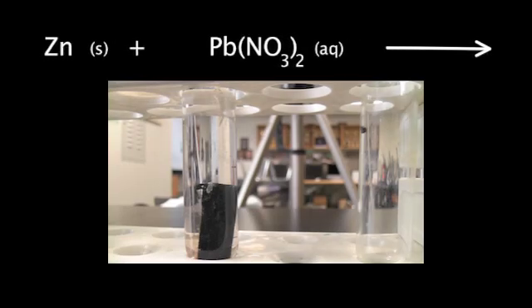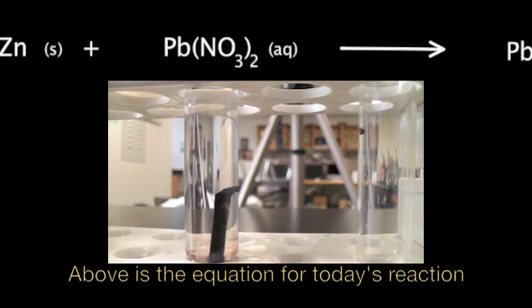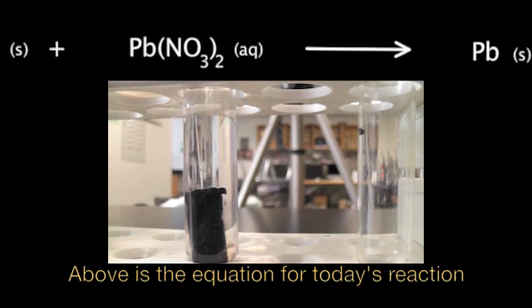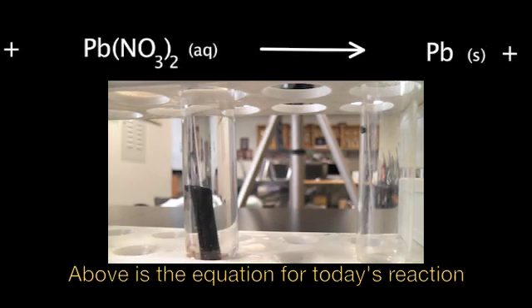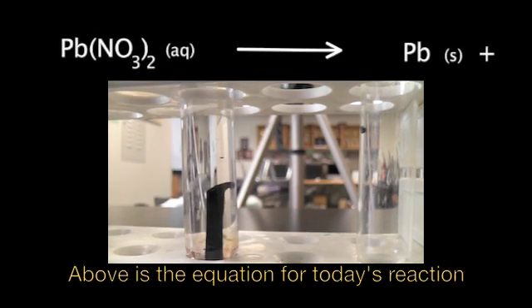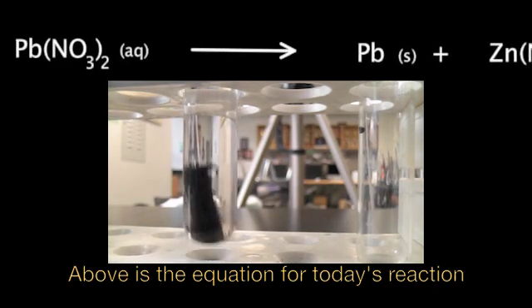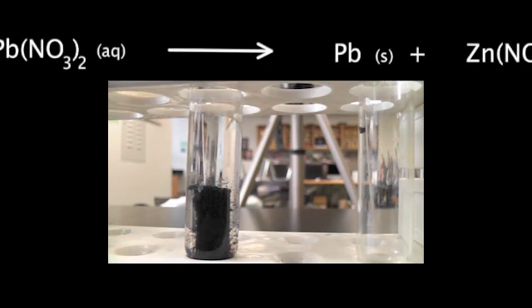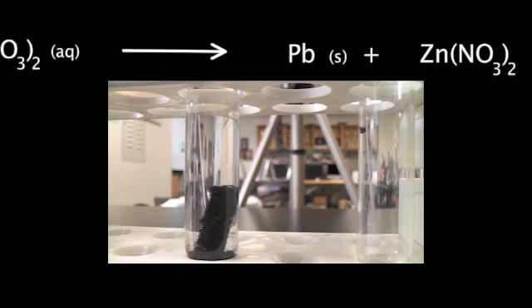If you look closely, the reaction is already occurring. Look at this piece of zinc — it was silvery, but now it's really dark. What's happening is the lead is forming as a solid, and the zinc is going into the solution. You can see the lead forming as a solid, and it is kind of flaking off.